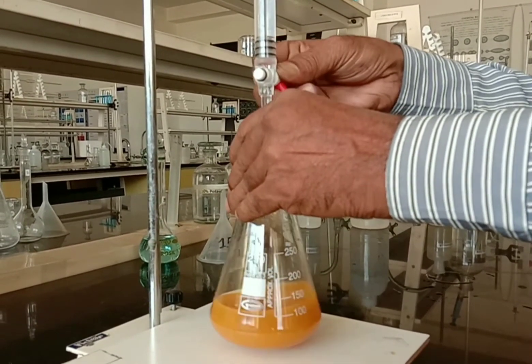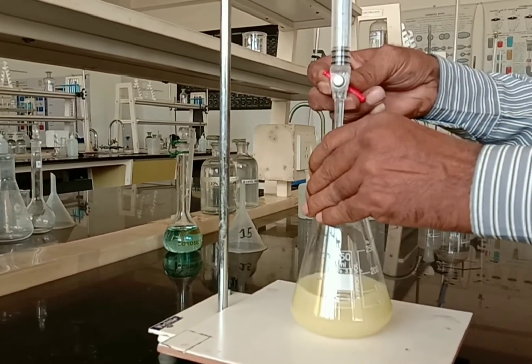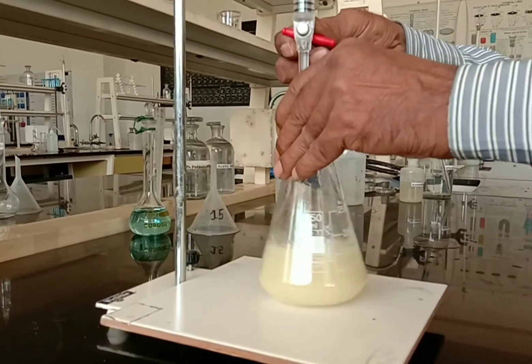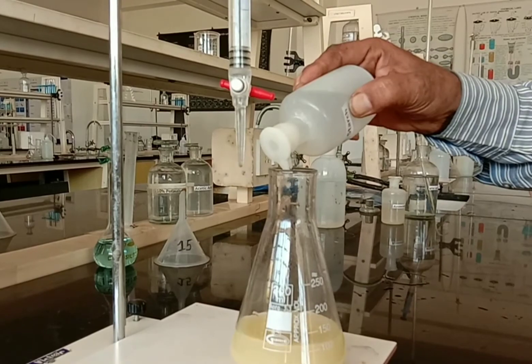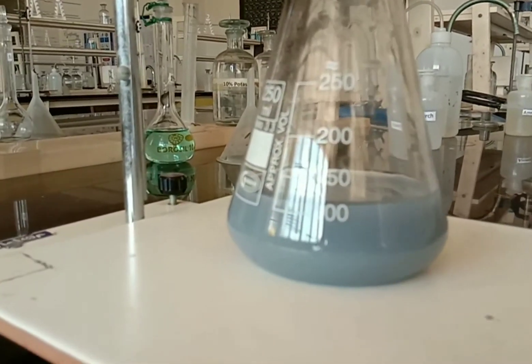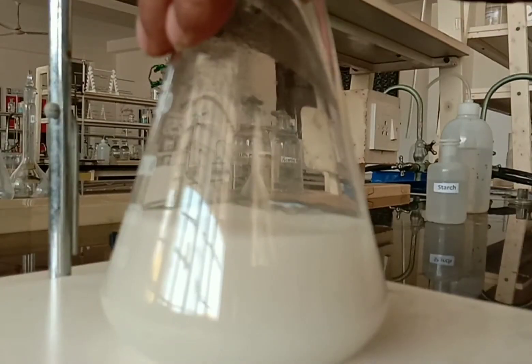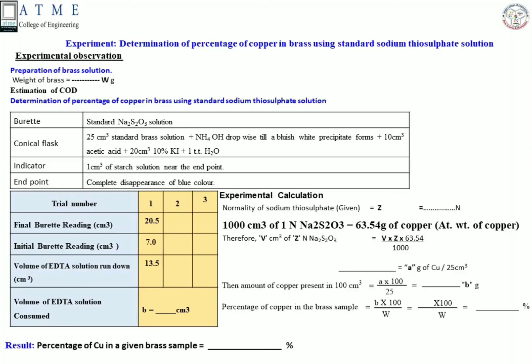Add about 20 cm³ of 10% potassium iodide solution. Using the weight of brass and normality of thiosulfate, which will be given to you, calculate the percentage of copper in the brass sample with the help of the given formula.